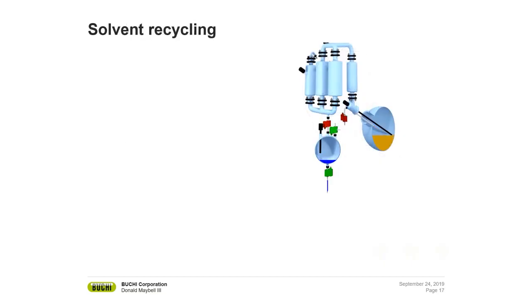So just a quick understanding of how solvent recycling and the automated process work. This is a good animation to show you how the process goes about. Essentially you have all of your waste solvent. It would automatically fill the evaporation flask, which is the yellow liquid there. It fills up to the level sensor. The level sensor gets tripped, and then it stops filling. And then the evaporation process occurs. That's where you see the blue going. So that's the solvent condensing down into the receiving flask.